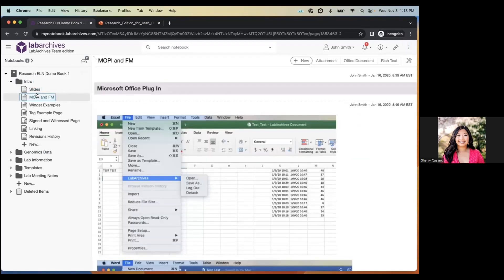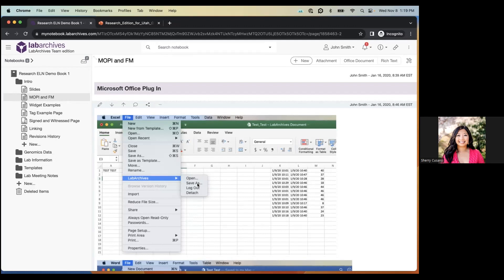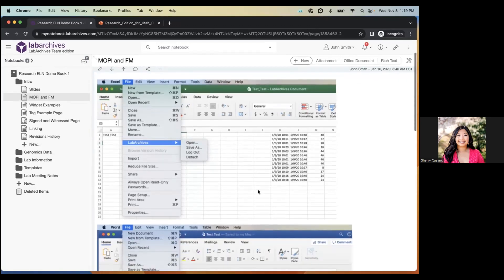The Microsoft Office plugin, once downloaded and installed, adds a Lab Archives option to Excel, Word, or PowerPoint — even without being logged in via the browser. You'll see options to 'Open from Lab Archives' or 'Save As to Lab Archives.' When you're done editing an Office document, just click 'Save As' and a window will let you choose which notebook, folder, and page to add the document to. This saves you the time of logging in separately.